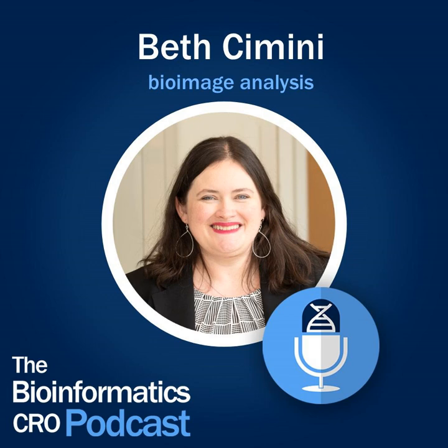So how can I change it the exact right amount? How do you approach rare phenotypes, subtle phenotypes, or single cell heterogeneity? Yeah, those are really hard. And those are things that, largely as a field, we still haven't come up with really good ways to deal with. I mean, one thing is always just to look at your data, look at your results, at whatever level of results you can look at.